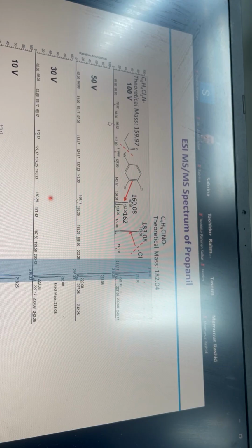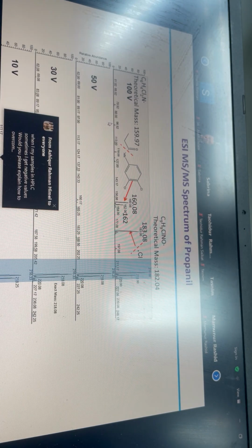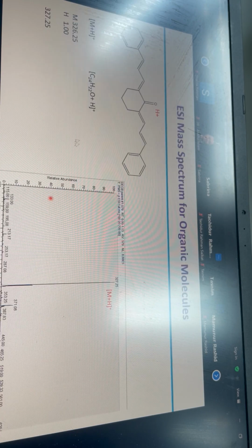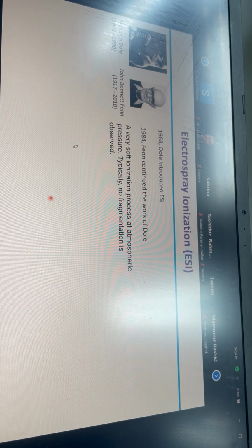That's why I started by talking about how all the ionization sources were invented, starting with how the cathode ray was discovered. Everyone is supposed to know how the cathode ray or the electron was discovered from high school or undergraduate. Is that right?